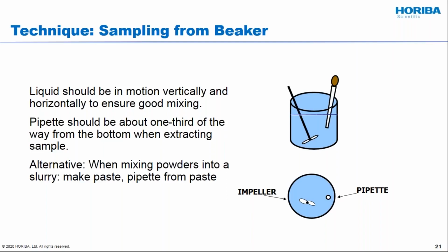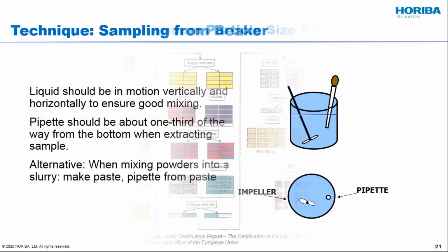And so again, you are going to have to go to different places in the beaker to get a good sampling, mix those materials together, and come up with a composite sample that you can hopefully stick directly in your instrument without having to touch it further. In some cases you may have to do this one or two or three times, if you have a very concentrated slurry and you're trying to dilute it down to 1/10 of a weight percent or something like that, that you would use for laser diffraction.